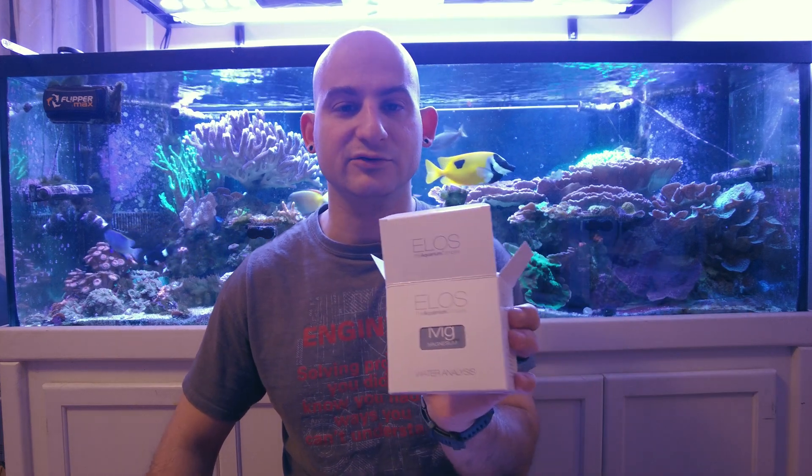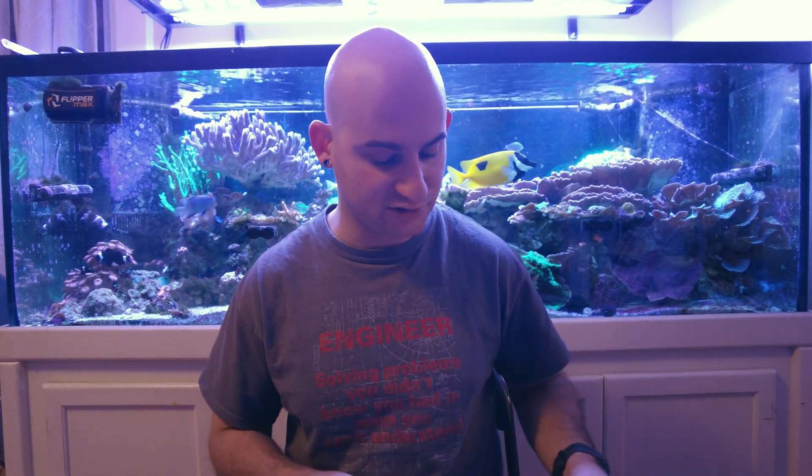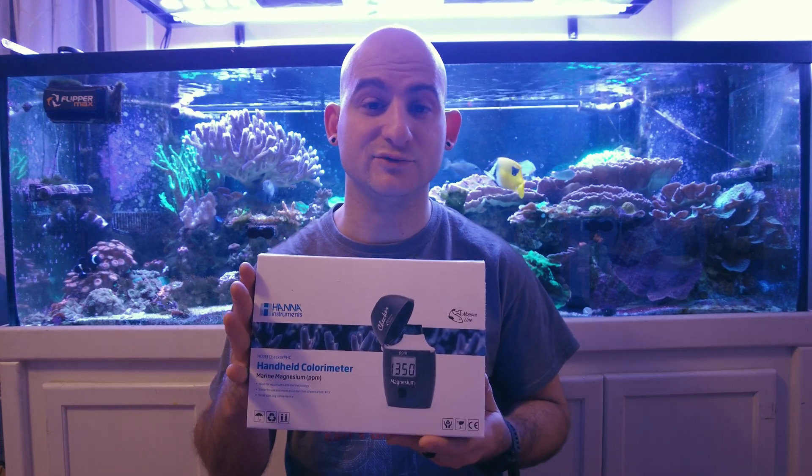Today we are doing some magnesium testing, which is not something most people do very often — myself included — to the point where my old magnesium test kit actually expired. The Red Sea test kit I think lasts two years, and it expired, so I was in the market for a new test kit. In our Facebook group, Saltwater Reef Keeping and Aquariums, I asked what everybody was using.